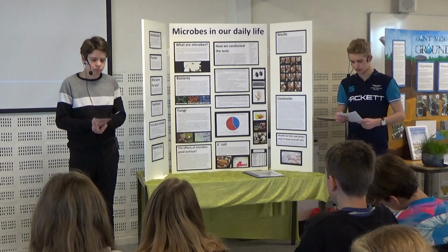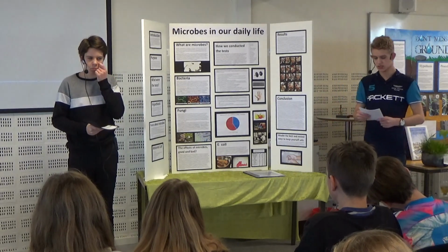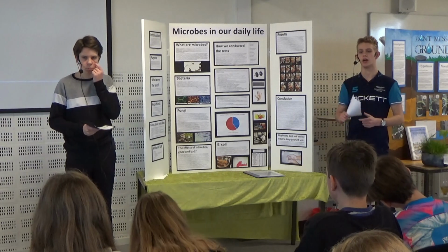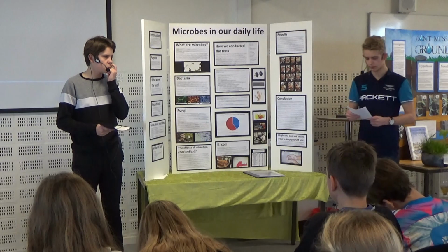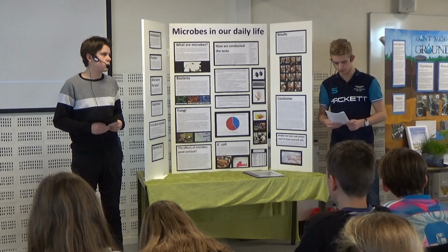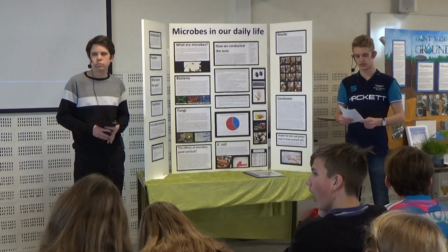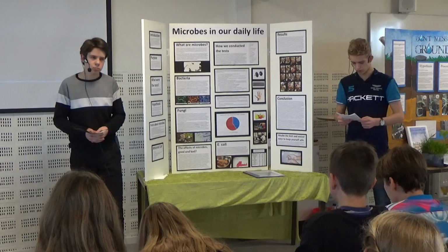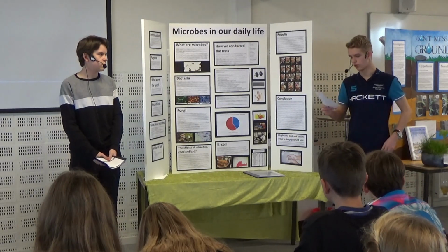Out from our results of the Petri dishes where we tested for unwashed and washed hands, we could easily conclude that washing your hands really helps. The presence of E. coli colonies dropped by 34 colonies, and the total fell by 10. Another very easy conclusion to make is that E. coli is nearly everywhere. One of the results that surprised us a bit was the one with the fruits.